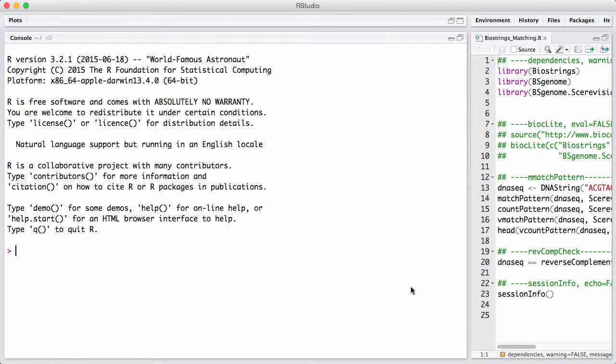If you really have millions of short reads, I would still recommend using a dedicated short read aligner, such as Bowtie or Mac, or one of the many other choices. But sometimes it can be incredibly convenient to be able to match a smaller set of sequences to the genome.